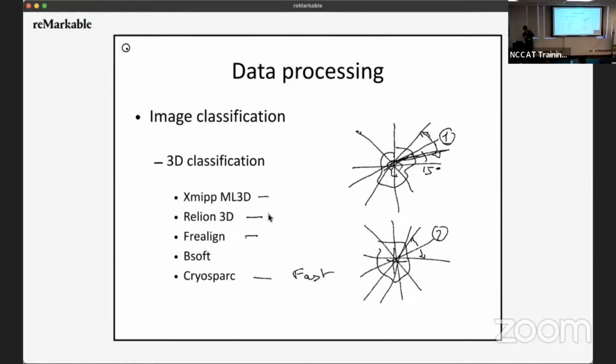So you need enough range that the particle can jump from one class to the other, and enough sampling that you can make the proper choice between the two solutions. And I found at 1.8 degrees, I can have enough range to not constrain while having pretty much the right choice. But usually particles are definitely happy 100% once you get to 1 degree. But in that case, you do get some constraints.